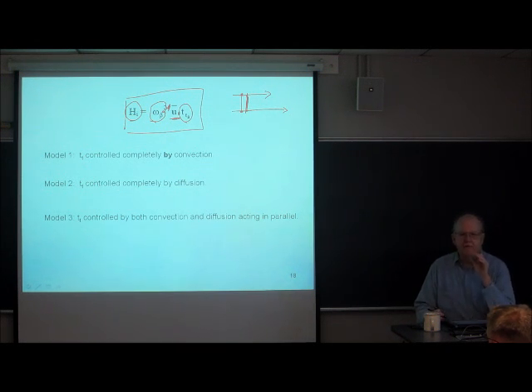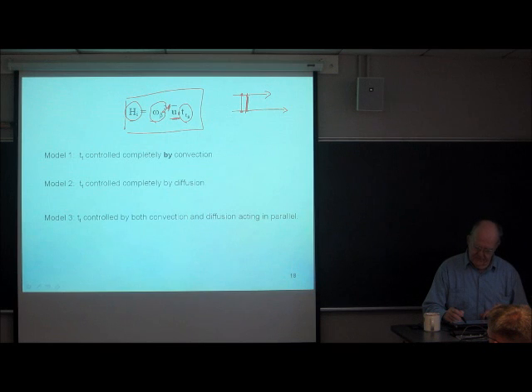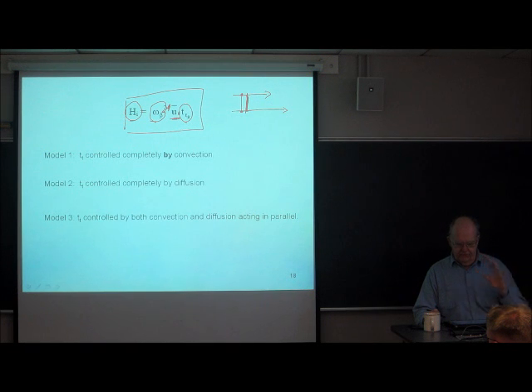And what Van Deemter said was that the time it takes to get from here to here, from the flow stream that you happen to be in to the average flow stream, is controlled totally and completely by convection, by the movement of the fluid, the gross convective flow of the gas or the liquid, whatever is the mobile phase.